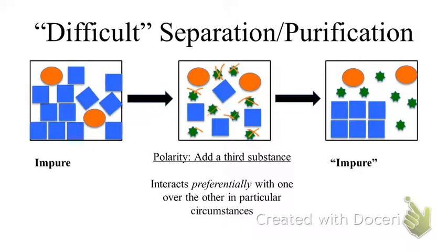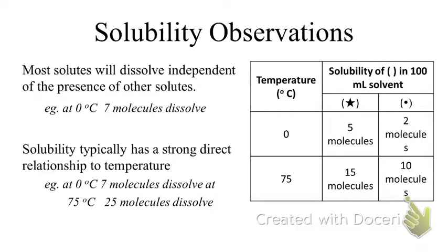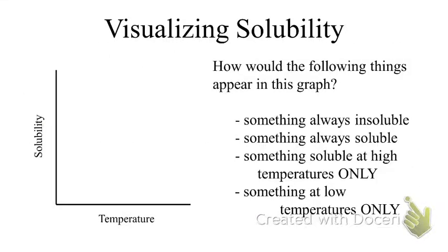We're using the solvent to allow us to get into that gas phase-like state, which then allows us to separate things. Heat is facilitating the breaking of the intermolecular forces, which is the exact same thing that our solvent does. So it's kind of a nice symbiotic relationship.